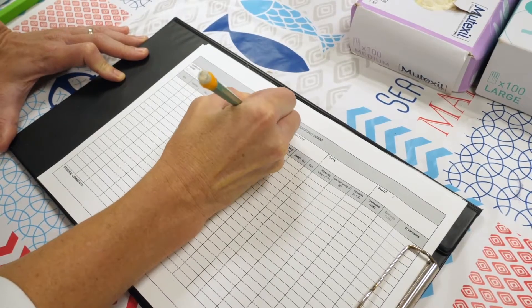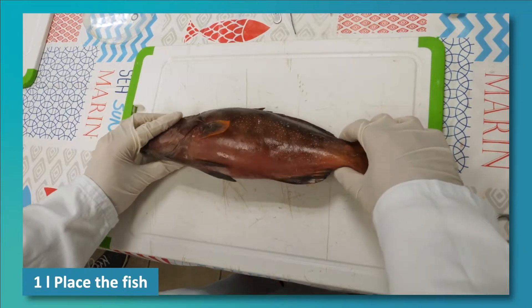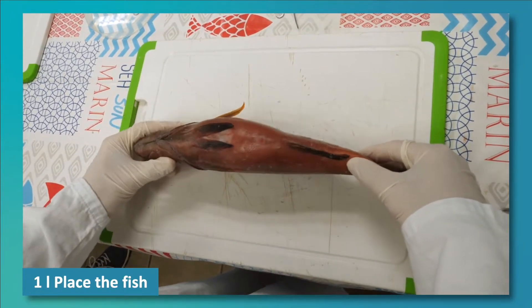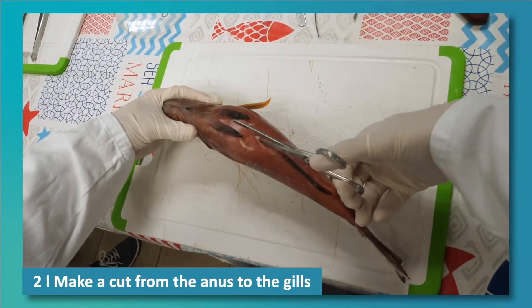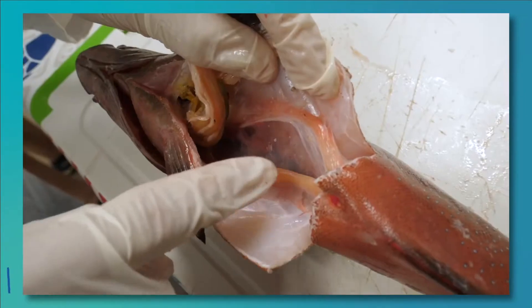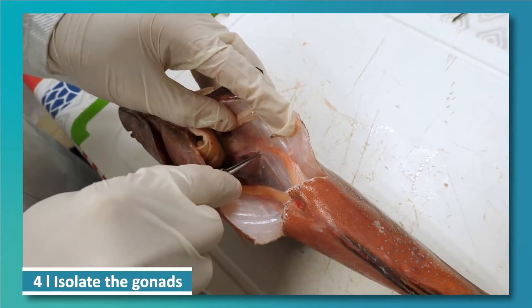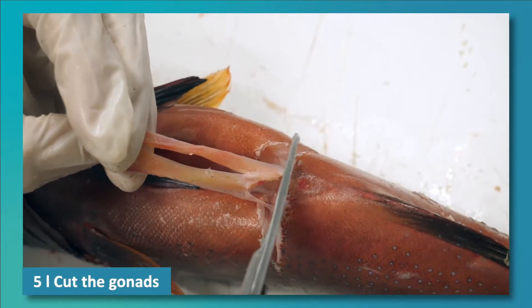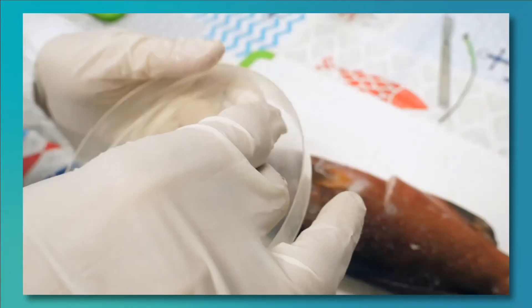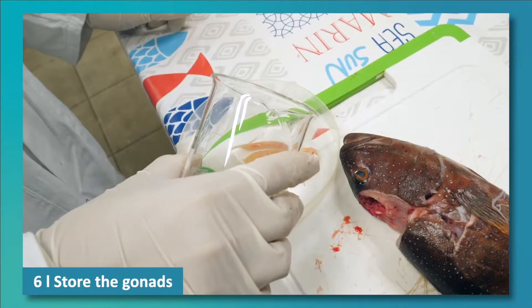Did you follow all that? Here's a summary of the method. Method 1: Place the fish with the abdominal cavity facing upwards. Make a cut from the anus to the gills. Locate the gonads. Isolate the gonads. Cut the gonads as close as possible to the anus. Store the gonads in a labelled container with a little water.